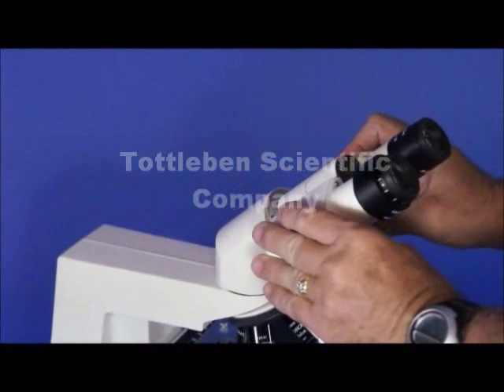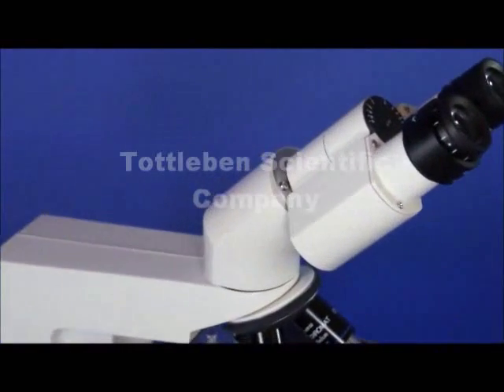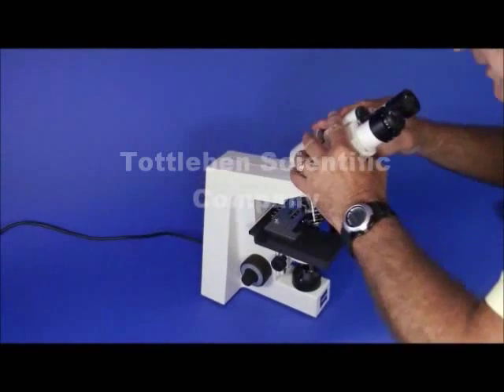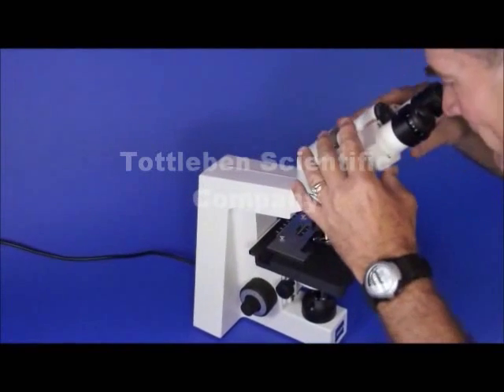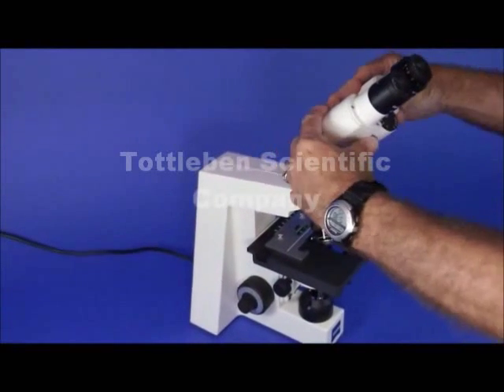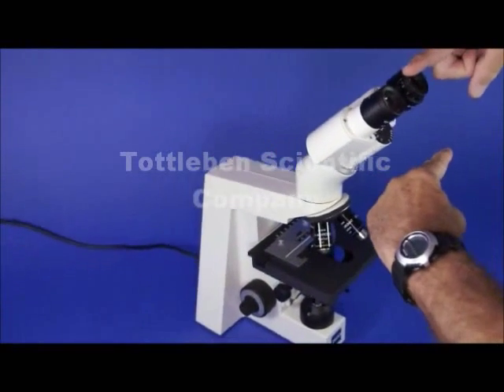An inclinable head gives you a lot of extra height for people who have different torso lengths. If you want to sit down but find that the height is too low for this microscope, you just turn it around and you've got all this extra increase in height.